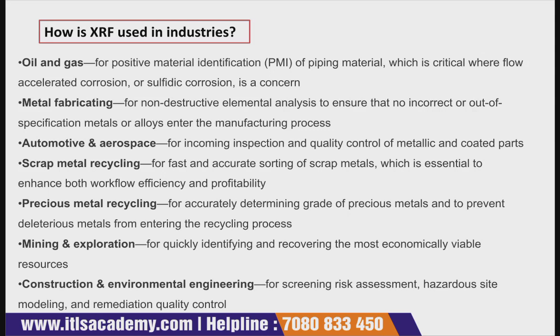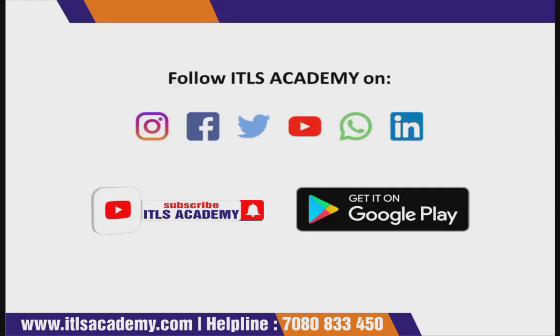So XRF is used there. If you see the applications, it has great application in different industries, like in oil and gases, in environmental, in mining. It has huge application in different industries. So because of this, the scope of this analytical method is becoming very broad. So that brings to the end of the lecture.